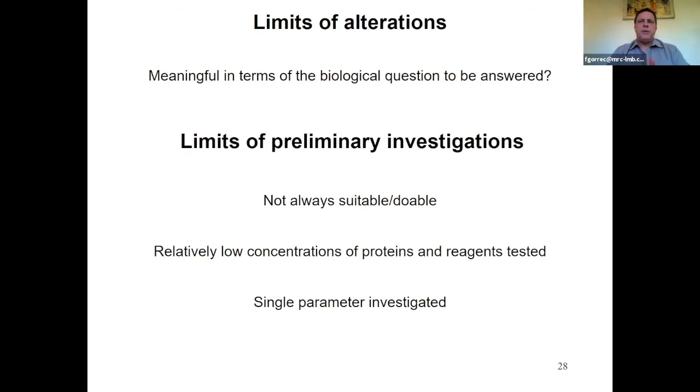And also an important aspect in all of this is that so far we are working at relatively low concentrations of proteins and reagents tested. Crystallization, we're going to see that in a minute, happens in saturated conditions. And also, you are well in control with all those assays because you are investigating a single parameter, whereas during crystallization, there's a lot of things happening at the same time.